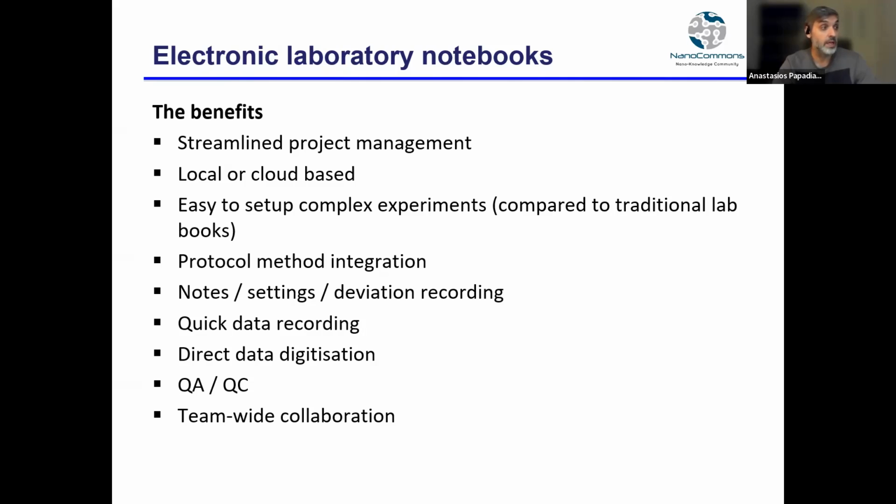They're easy to set up, and you can set up complex experiments where you need to capture a lot of things in different matrices, etc. You can have your protocols inside, notes, record the settings from different instruments without the danger of forgetting something, or if you deviated from a required protocol, etc. You digitize your data directly, and then you can more easily quality control your results, your data, your processes.